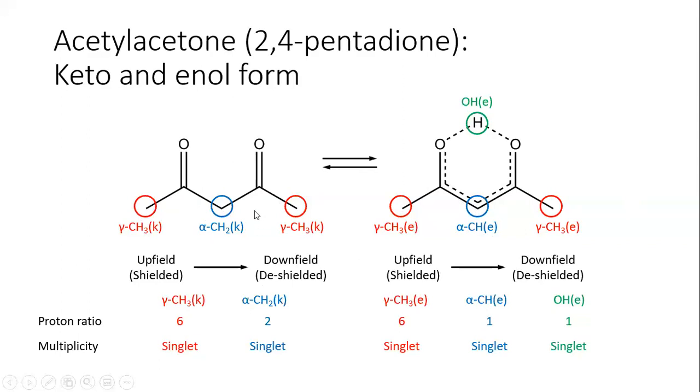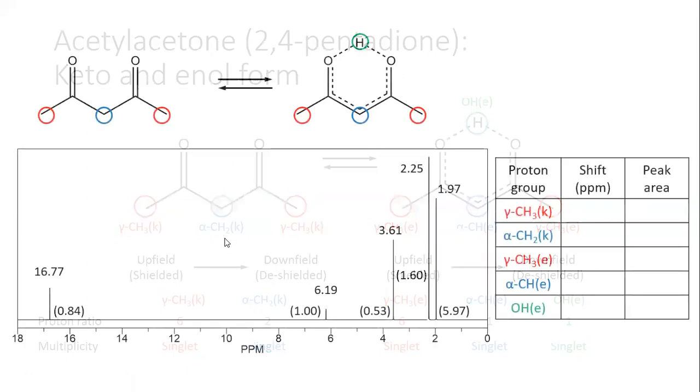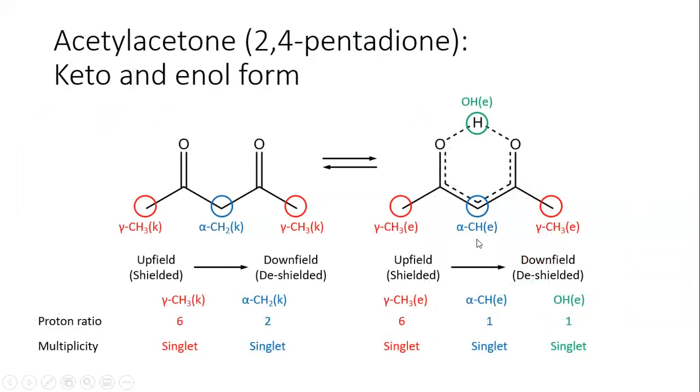The situation will change, of course, if, let's say, I put a methyl group here, right? Or here. Then my hydrogen here and the methyl will be neighbors, and of course they will split. And the splitting is determined by the number of protons on the neighboring atoms.